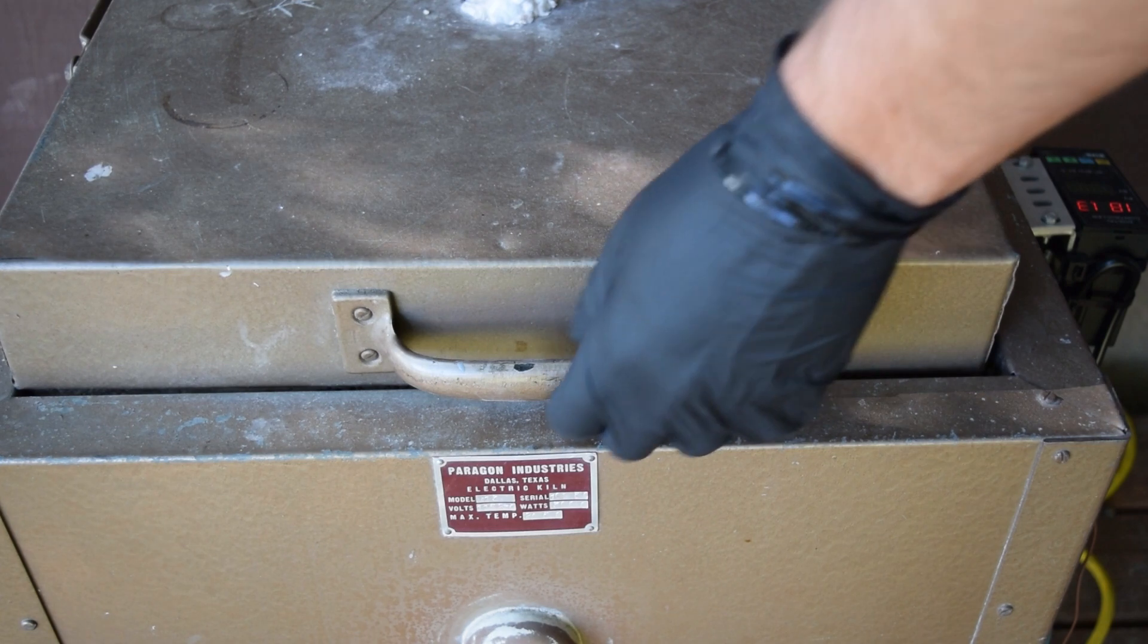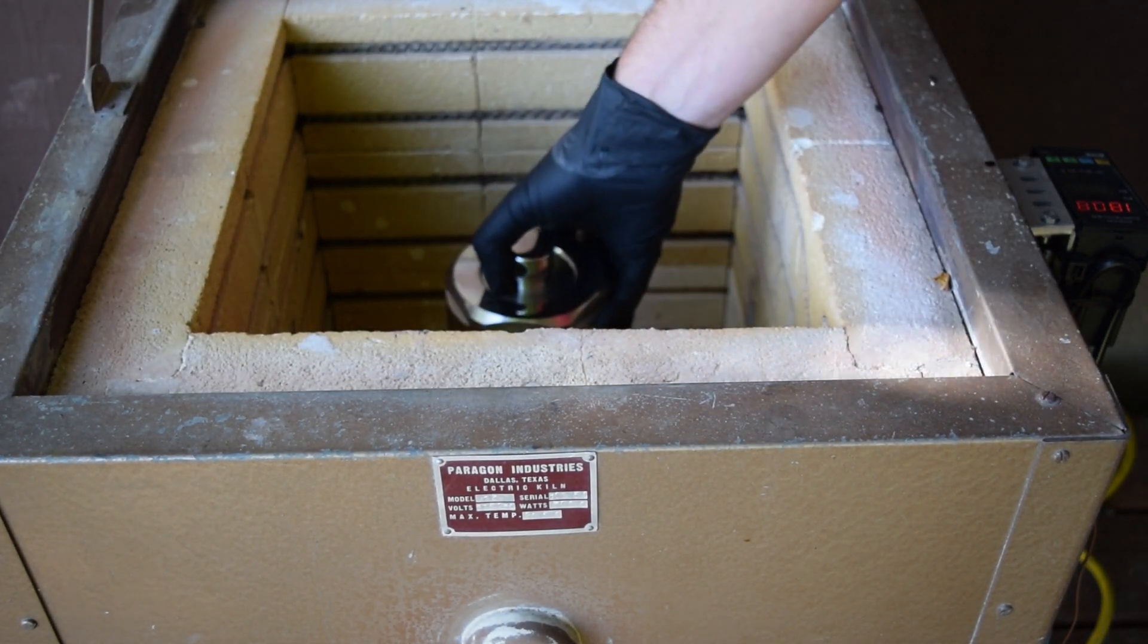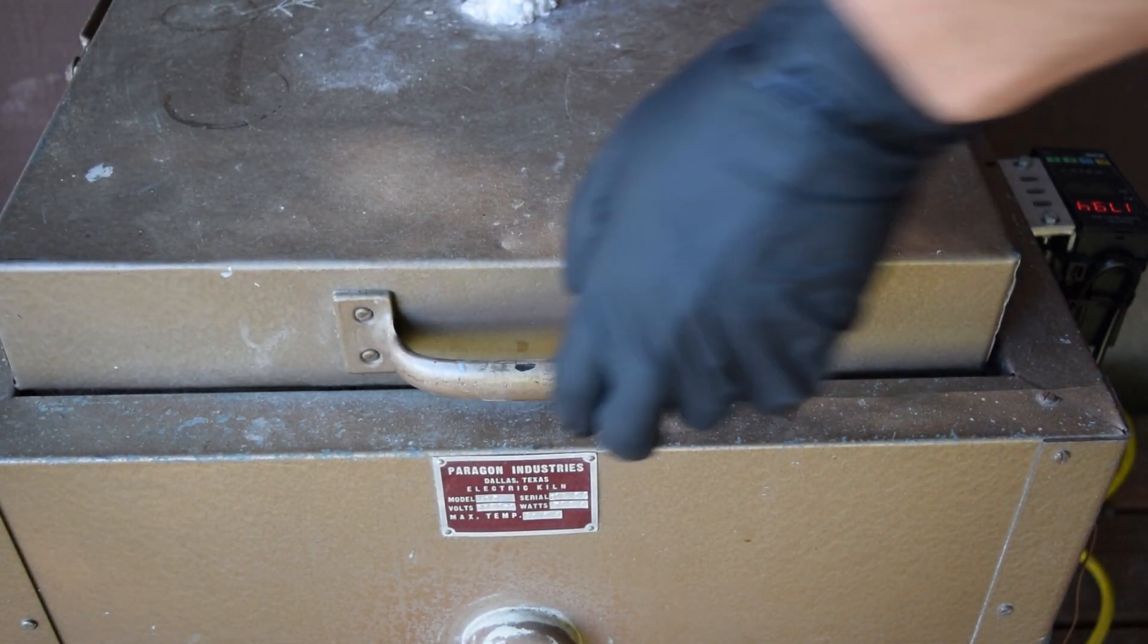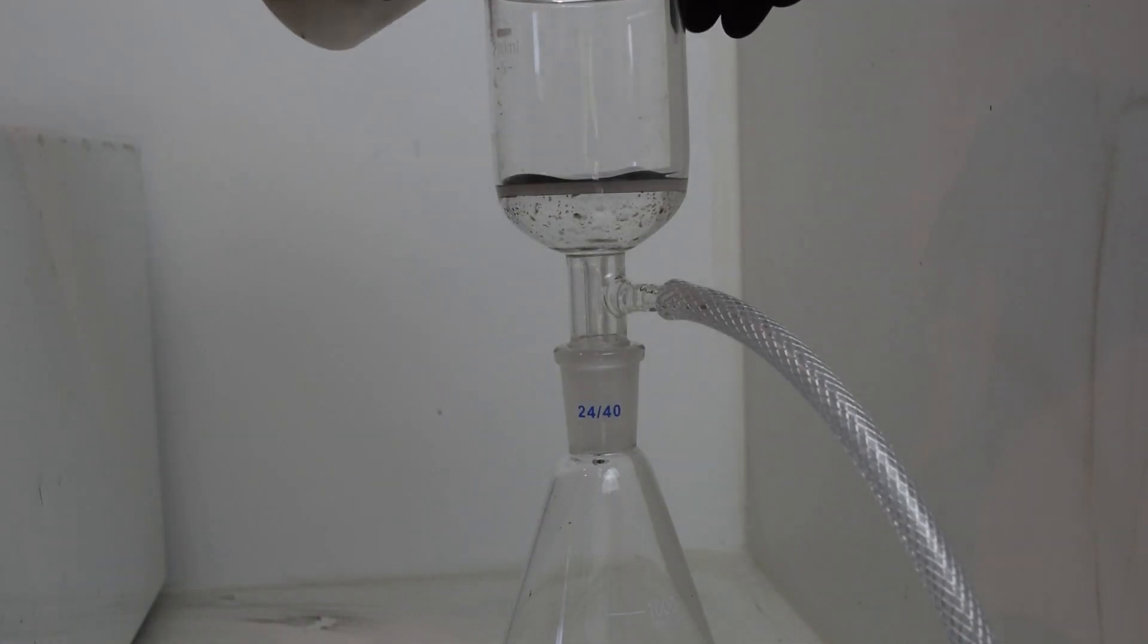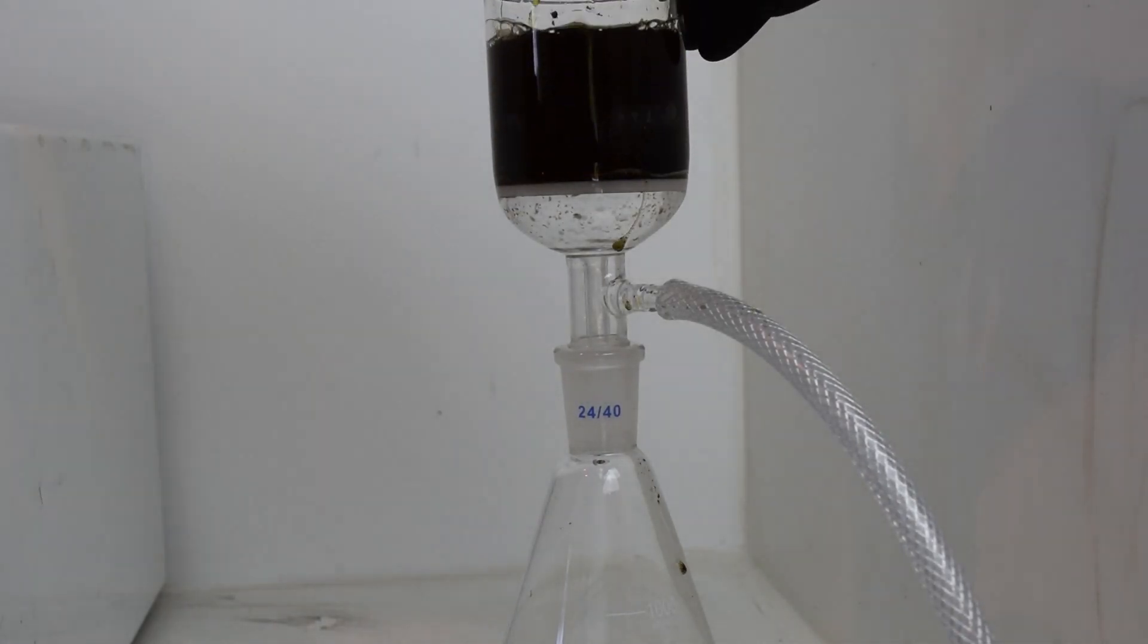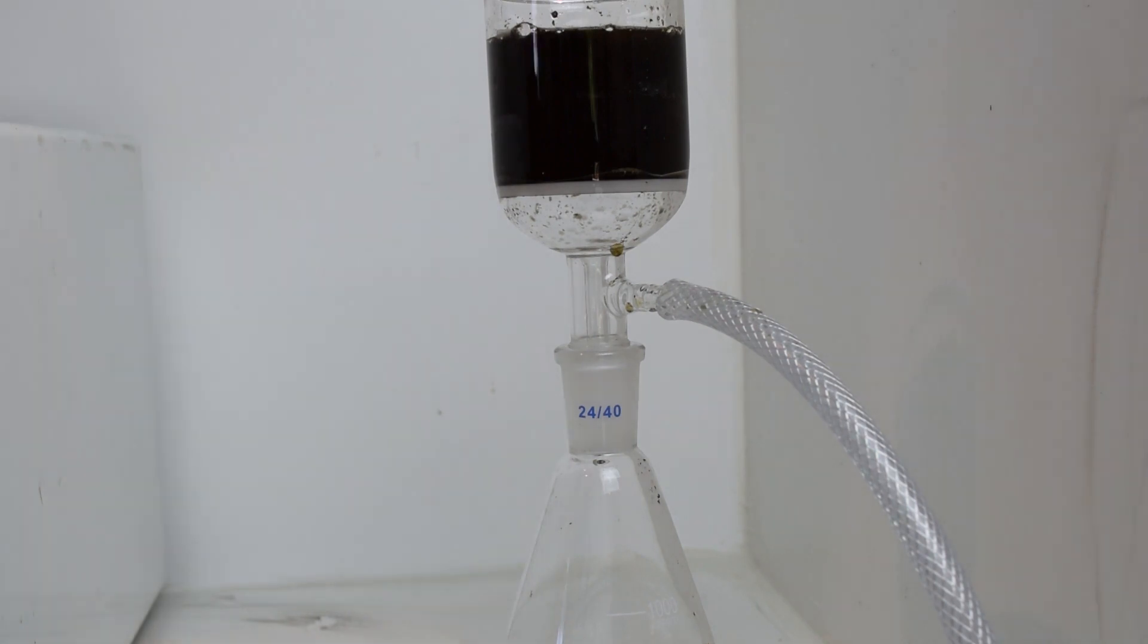After being sealed, the autoclave is heated at 180 degrees Celsius for 24 hours. The resulting biochar is then washed with about 500 milliliters of deionized or distilled water until the water runs clear.